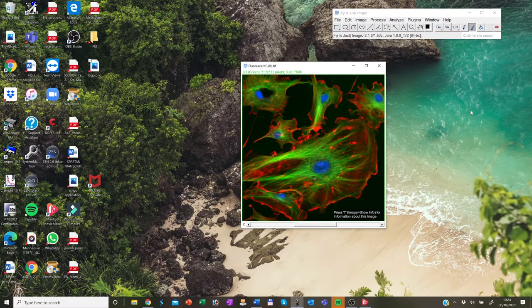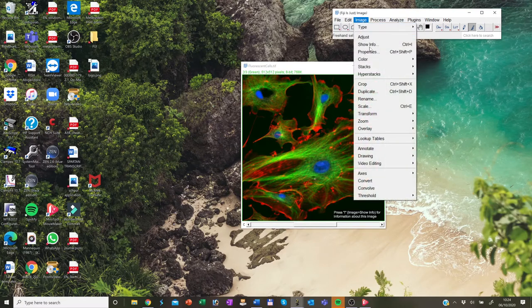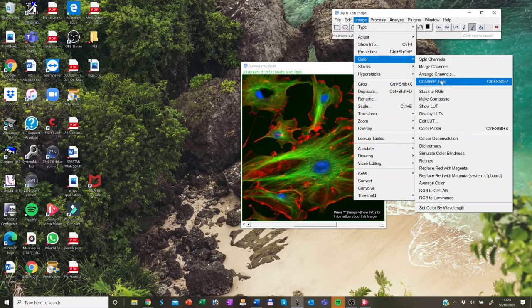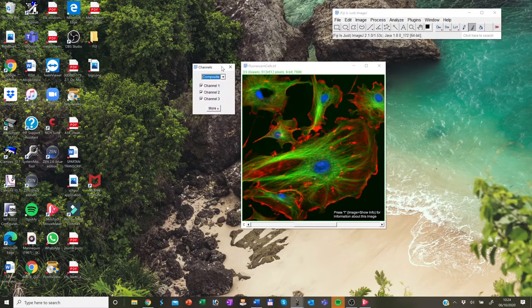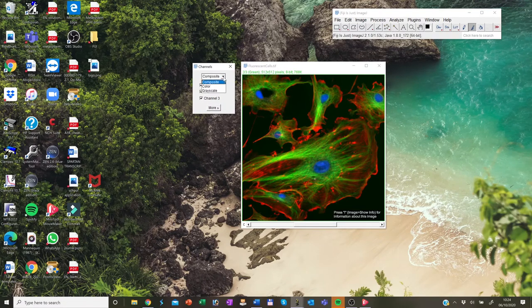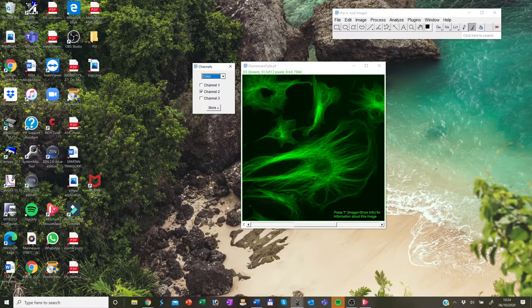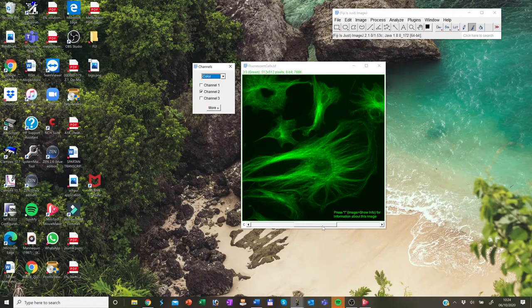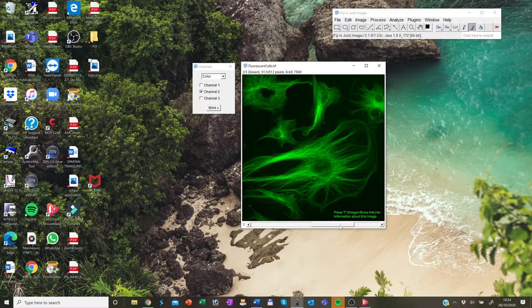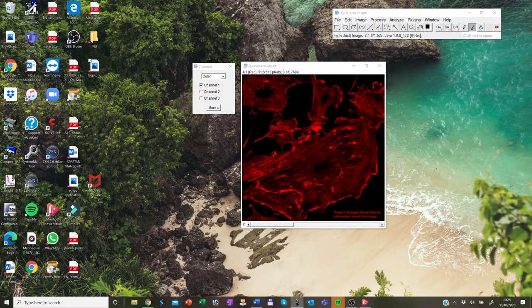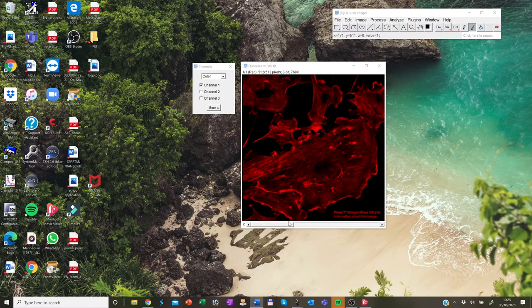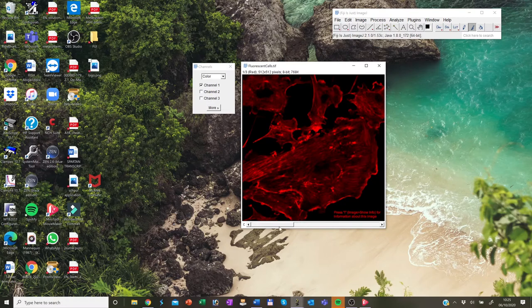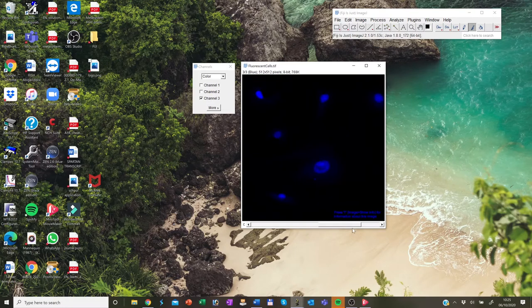To split the channels, you go on image, color and channel tools, and that opens up this channel window. And in here, you can choose the color. And if you choose that, then the image is still displayed as a color for default mode. So there are still three positions, one for each channel along the bottom. However, this time only the selected channels will be displayed.